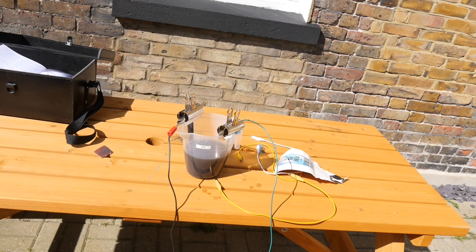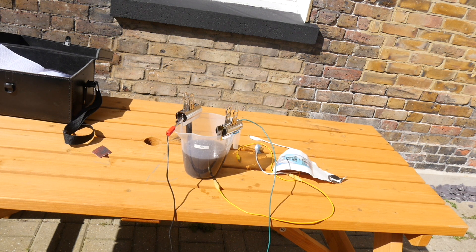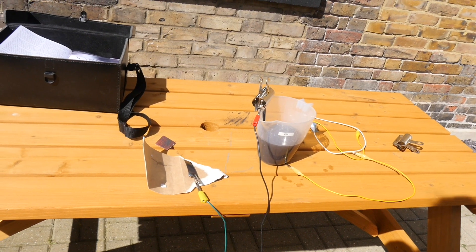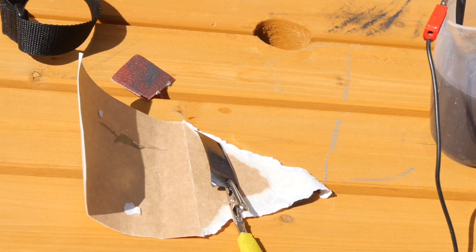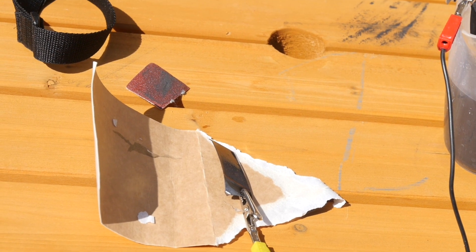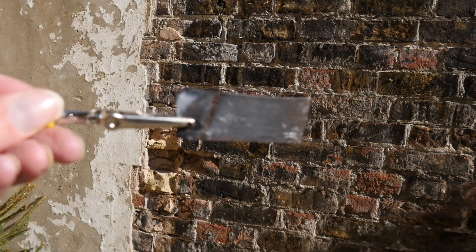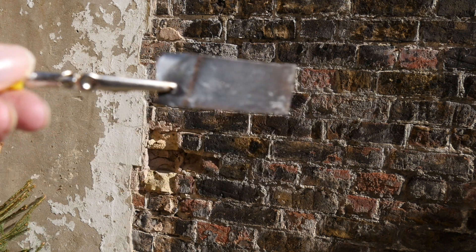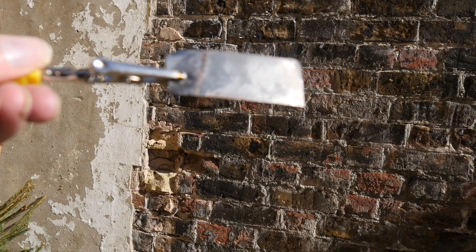We've just tried this for the third time. This time we filed the graphite and the copper down, just in case they had a little coating on them, because last time the silver just seemed to slide off. I'm going to unveil it now and see how it's worked. I've just taken it out and it seems to have worked much better this time. You can see it's got this kind of shiny patina on it — I'm going to leave it to dry.